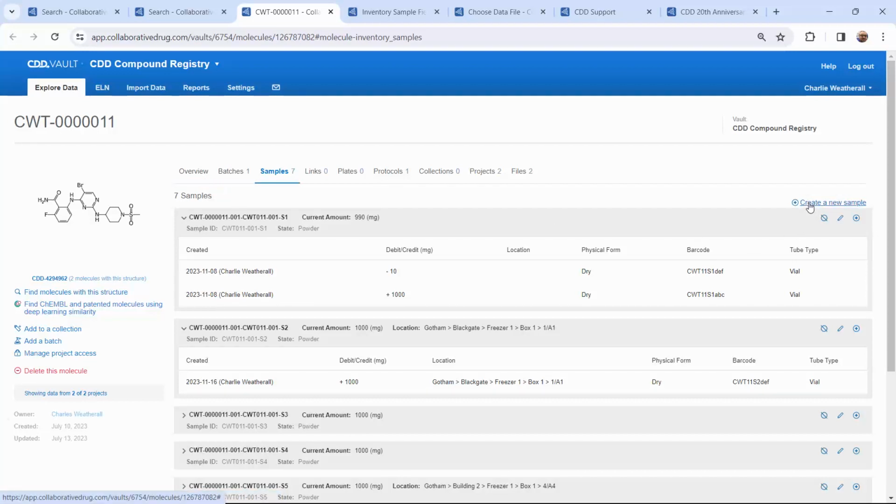So yes, you may create a new sample. Ta-da! We are also plugged into the import data wizard that you all know and love. So you may import a whole bunch of samples. If you're like me, you would do this on Friday with a 6-pack of beer for every other person in your whole organization because you were the low person on the totem pole and that was your job. So yes, you may import these samples in bulk and even these events there.